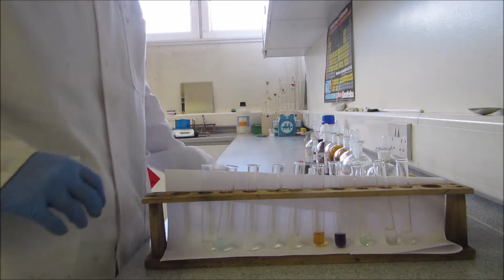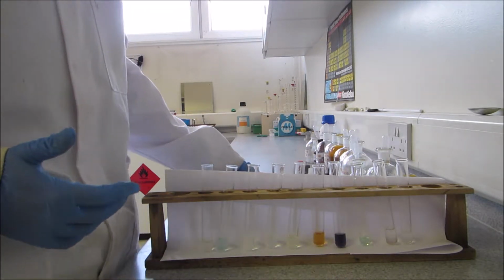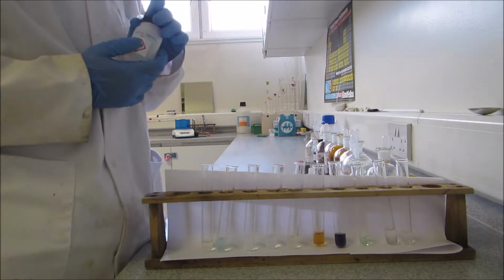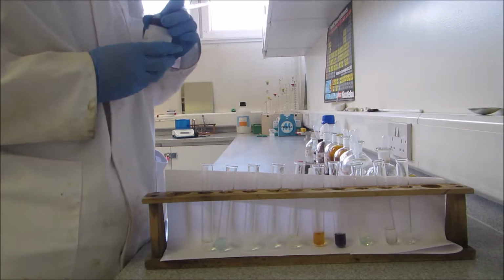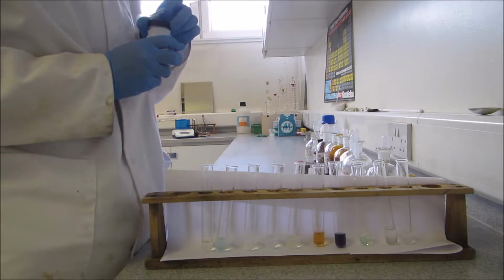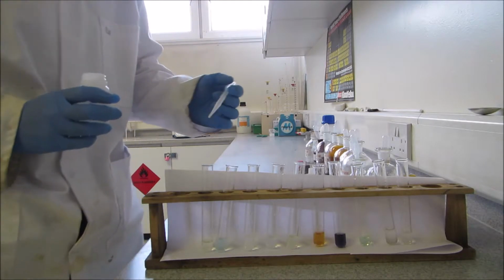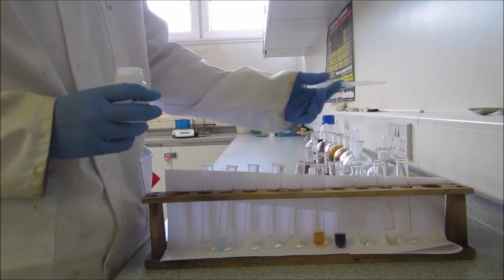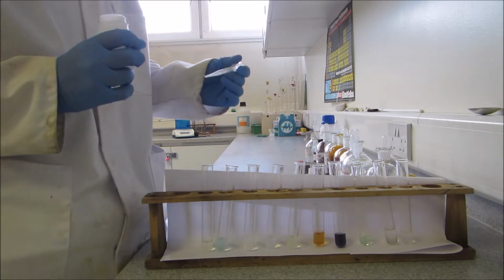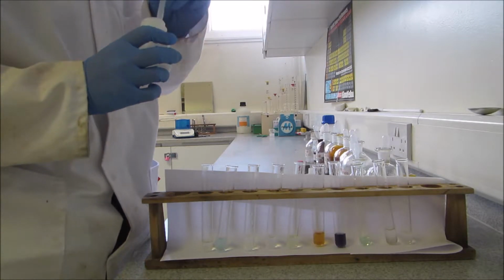In addition to flame tests, it's also possible to identify cations, or the metal ions, in an unknown salt using a range of tests, basically where you react it with sodium hydroxide, and depending on the colour and the complex formed, it will help to identify the cation. So I've measured out 2 milliliters of a range of different salt solutions, and I'm going to add sodium hydroxide to each one, and based on the reaction predict which salt it is.